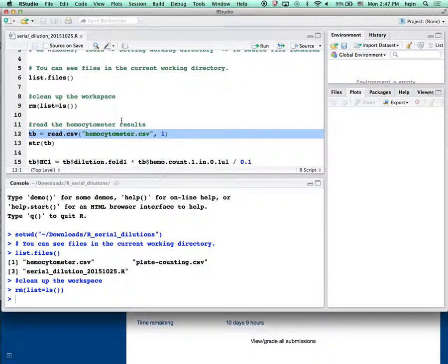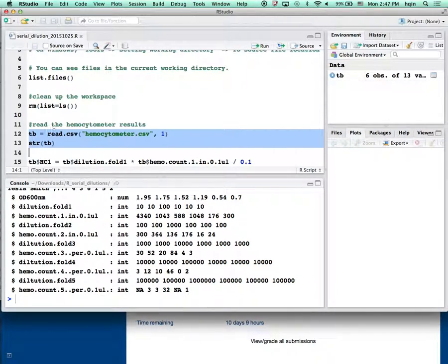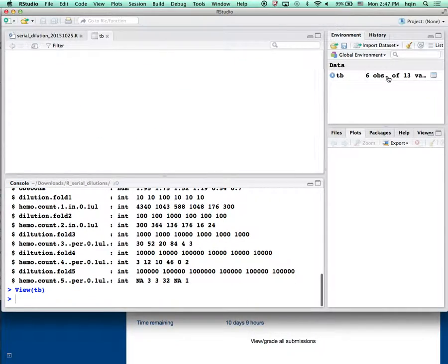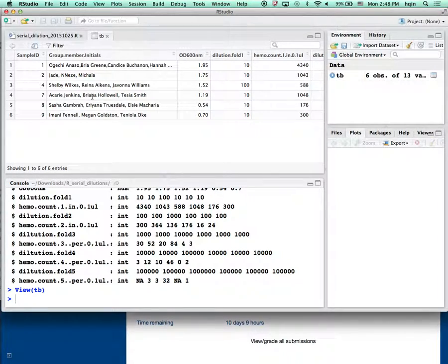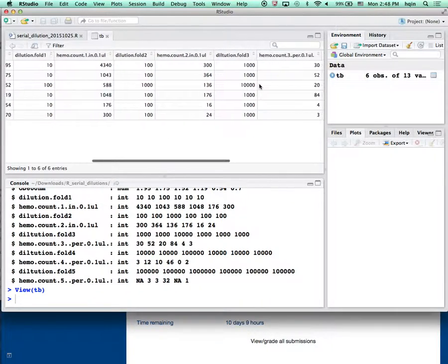Now we're going to read the hemocytometer data first. On the right-hand side you can see read.csv, which reads that CSV data file. 'TB' is my shorthand for table — I read everything into a table in RStudio. If I click on TB, you will see the hemocytometer counting results: all six groups with sample ID, OD value, and dilution counts for dilutions 1 through 4.